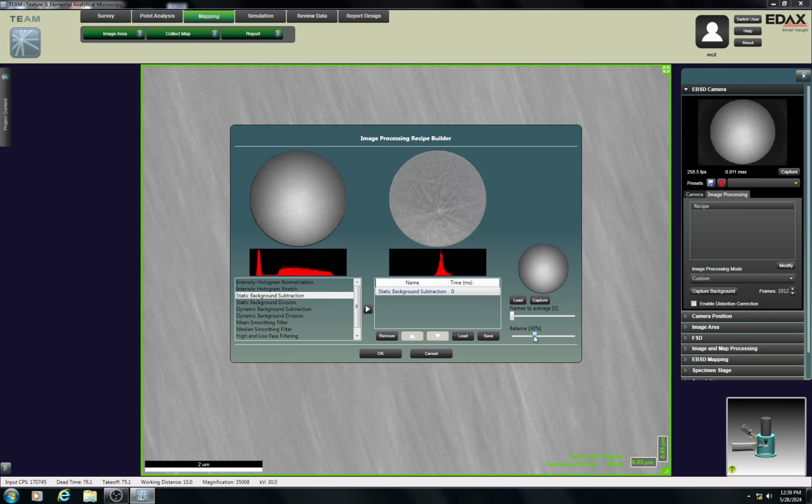So maybe, and if my balance is too low, I also don't really get a good result. Let's just put it somewhere maybe like 40. I think 40% is the default value, which as you can tell, works pretty well. Maybe a little higher is nice for this case.